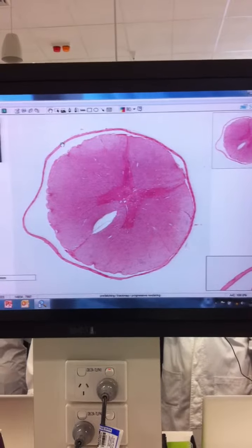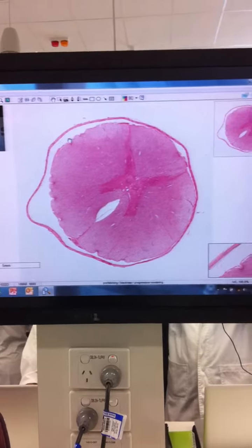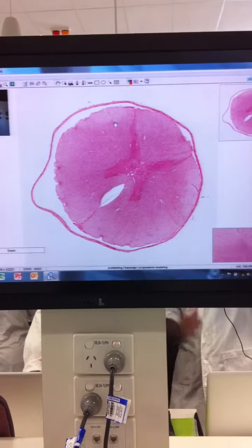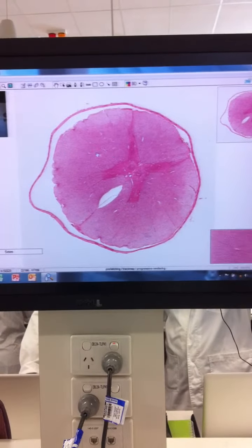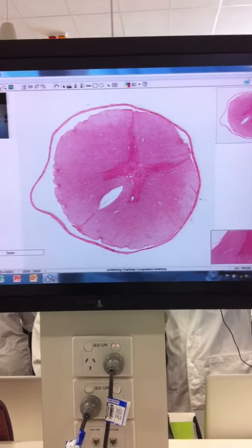A second, is the dura mater. So obviously a bit of artifactual separation. And then we've got the white matter here, and then the grey matter. And the grey matter is this very characteristic butterfly sort of shape.